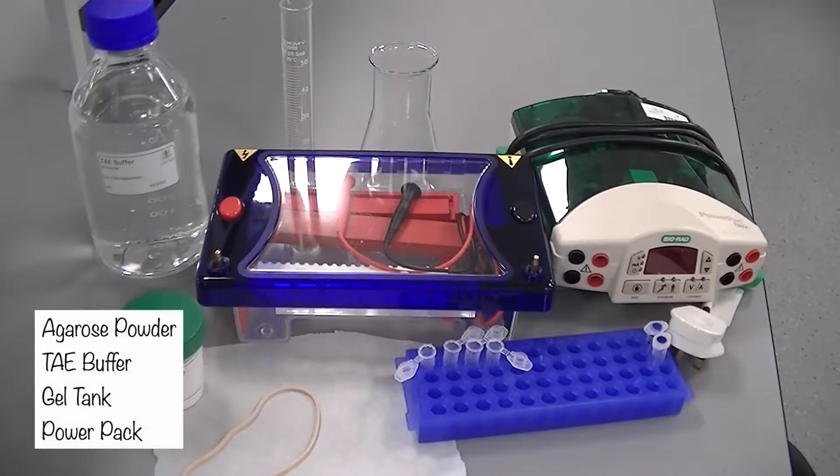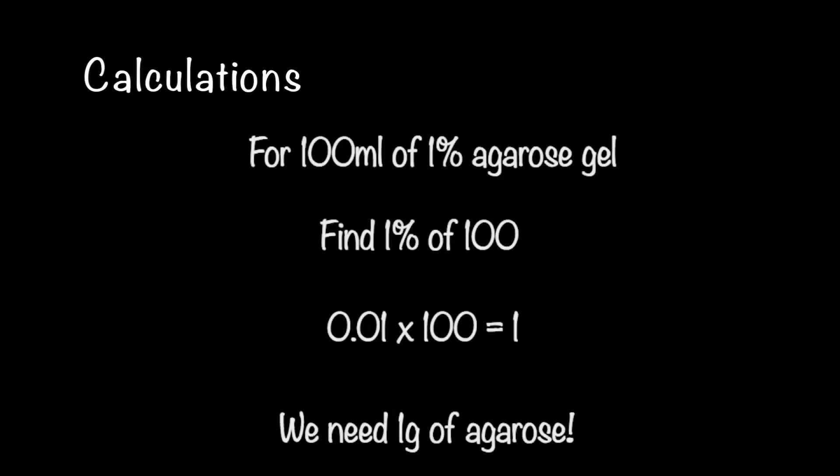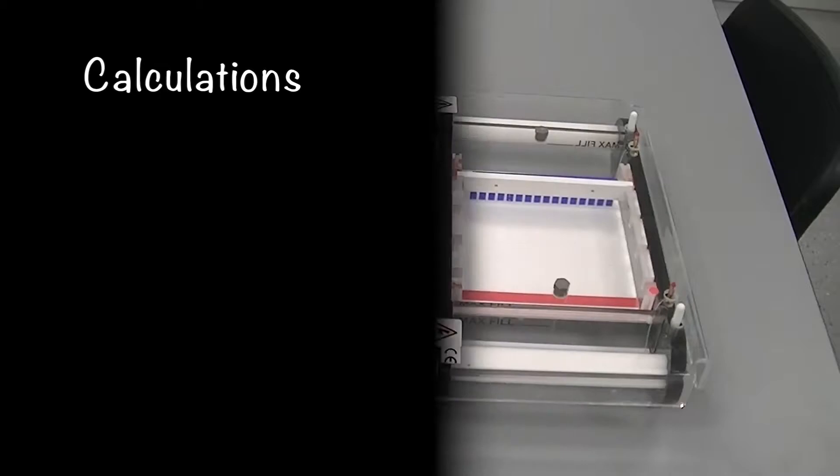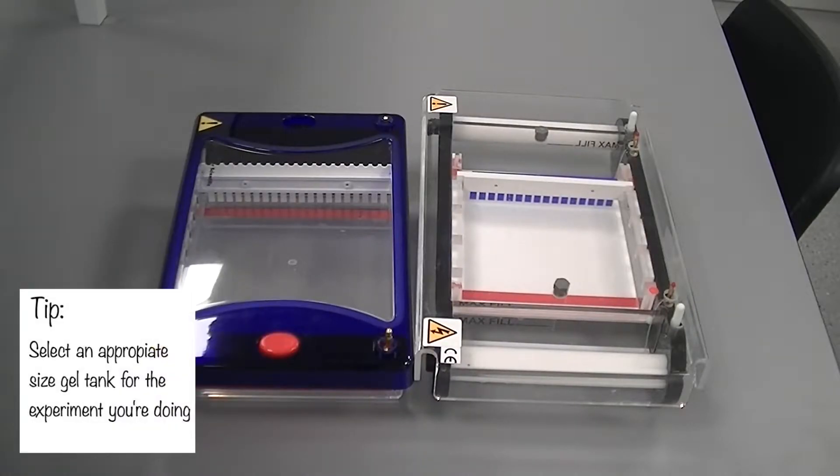Here's the equipment we'll need for this video. Before you make the gel, you need to figure out what percentage of gel and what volume you're making. There are different sized gel tanks available to use.